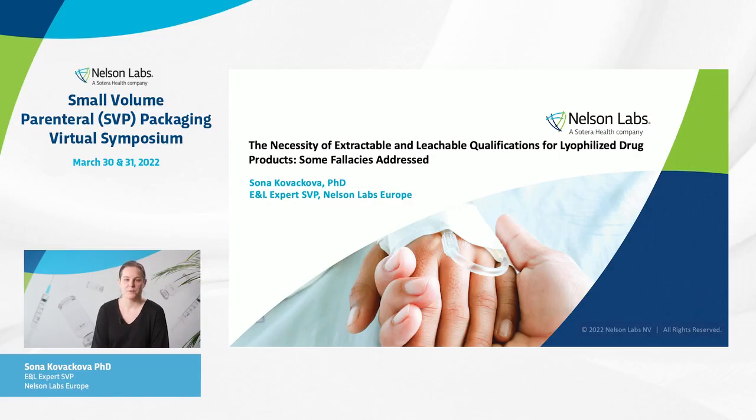Today, I'll talk about the necessity of E&L qualifications for the lyophilized drug products and the primary packaging. I'll also explain why there has been such a debate about E&L qualifications for this type of drug products, and based on our internal observations, I'll address some of the most common misconceptions and challenges that exist in the E&L field for the lyophilized applications.